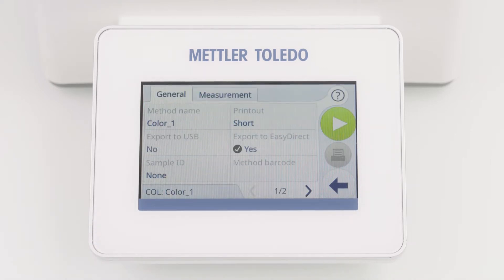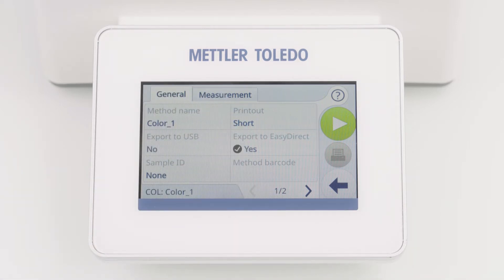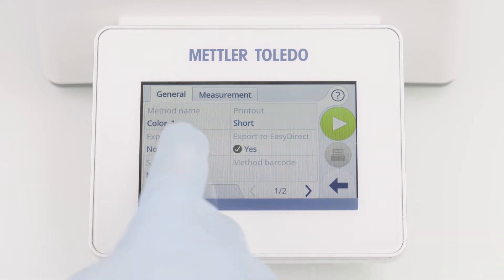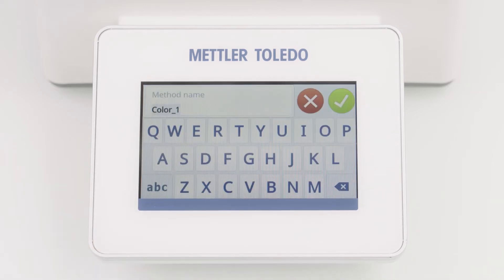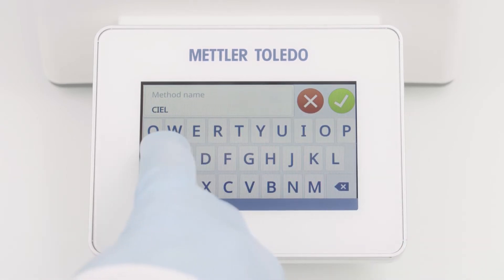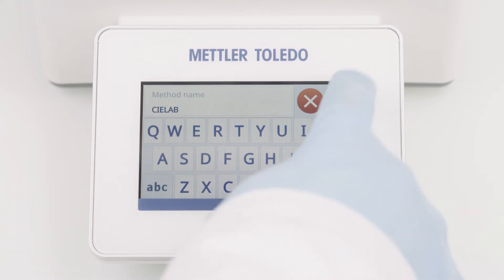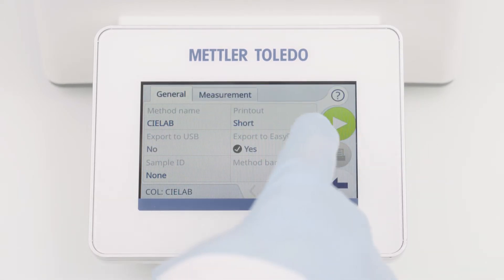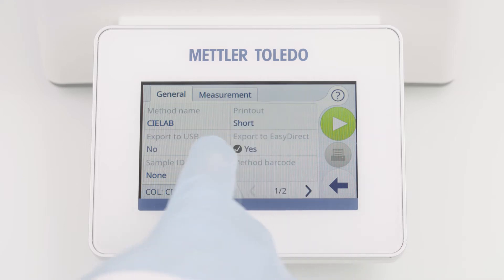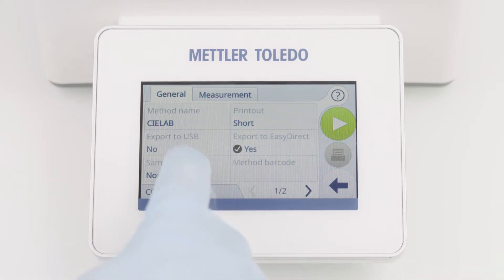The method editor shows two tabs: General and Measurement. The General tab is the same for all measurement categories. You can change parameters, for example the method name. You can also choose between different export options or define sample IDs.